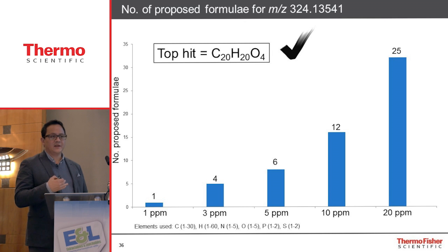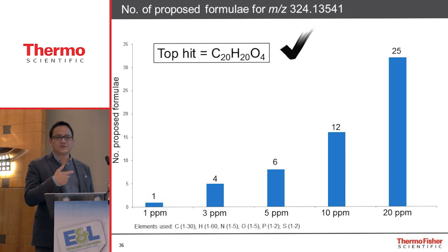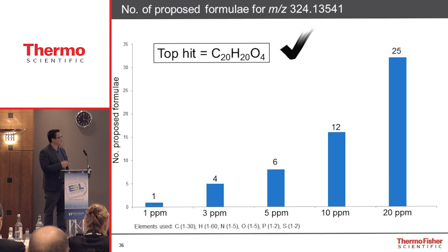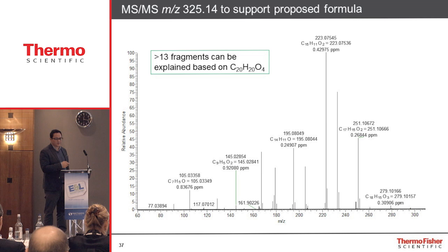I've gone on about the mass accuracy for a long time and probably repeatedly, but this is the true value, because mass accuracy on most instruments on the market would sit around 6 to maybe 10, some around 20 ppm on time of flight instrumentation down at these low molecular weights. In reality, at 1 ppm, the analysis of this unknown would give you only one elemental composition. So within a few seconds, you have a very high confidence elemental composition result to work with for an unknown that's not in your library.